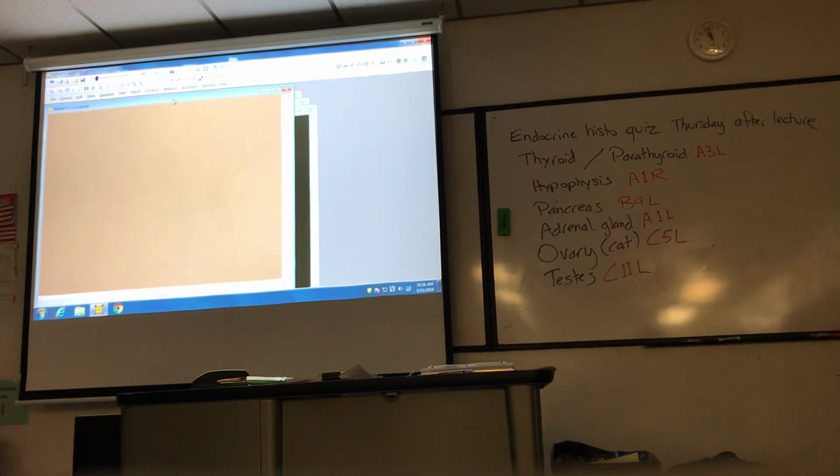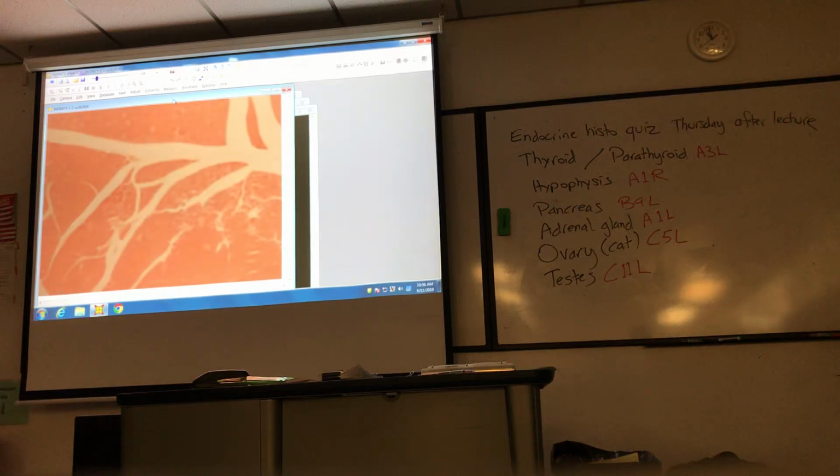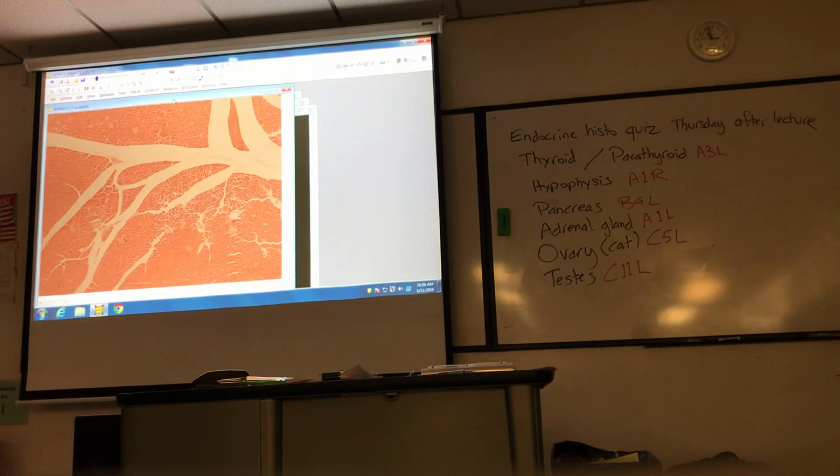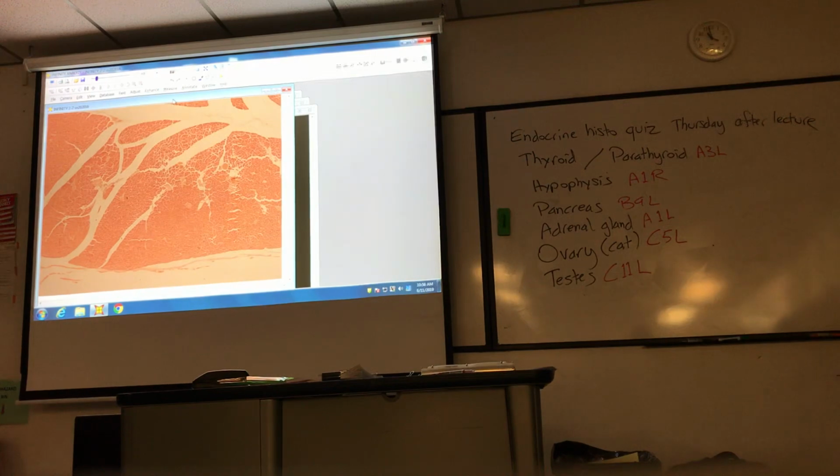Let's see what we got here. You're looking for something called pancreatic islets or islets of Langerhans.